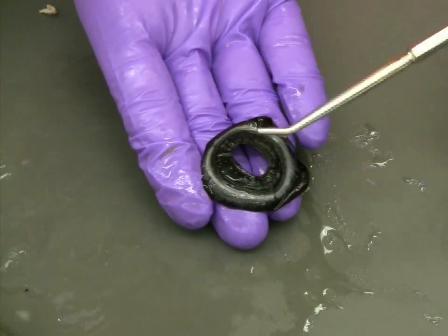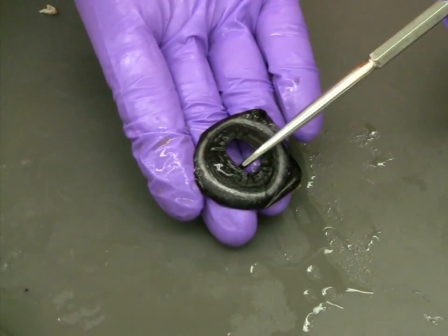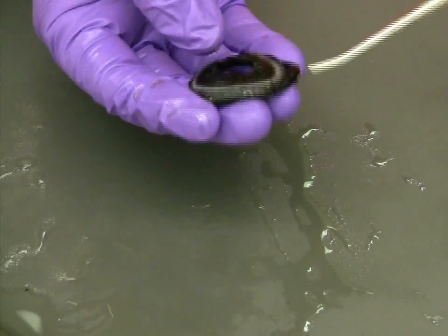Removed from the eye, we can now see the whole structure of the iris, including the pupil and the surrounding muscle.